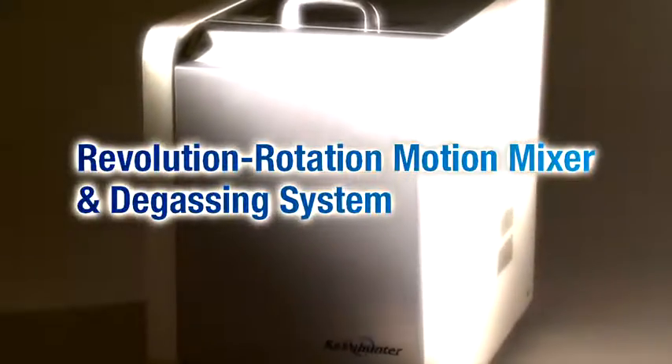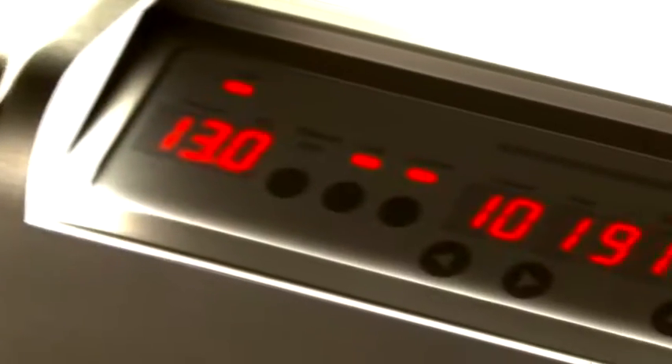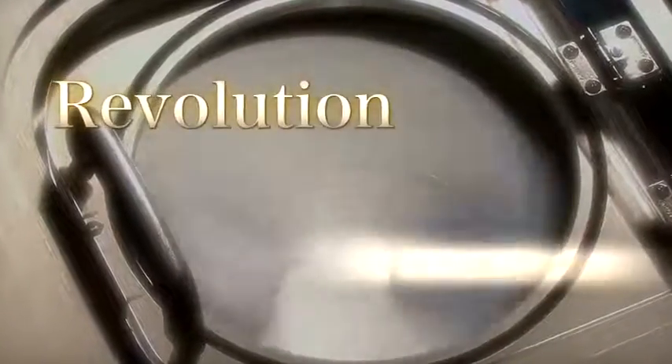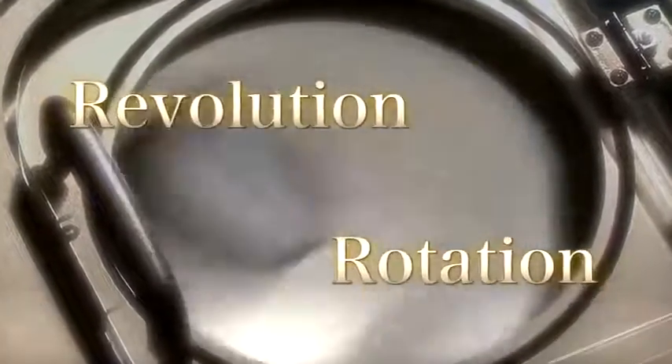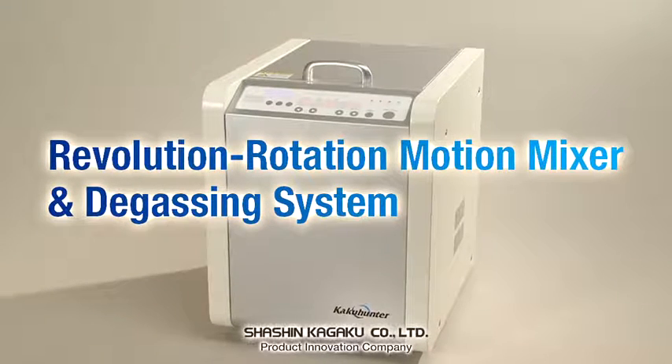A trusted expert in mixing and degassing. This functionally sophisticated mixer degasser from Shashin Kagaku allows users to set revolution and rotation speed separately, which makes it applicable to a wide range of fields and products, including chemicals, cosmetics and pharmaceuticals.